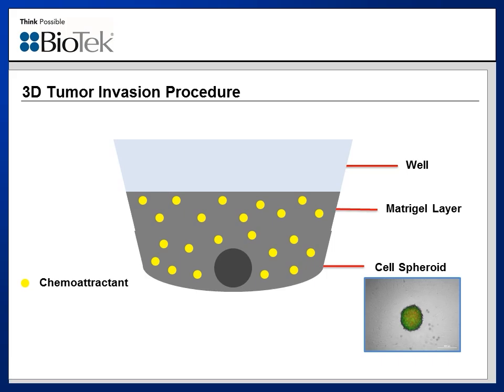And again, the same procedure is followed in the case of running an inhibitor experiment, with the difference being that an inhibitor is also added along with the chemoattractant to the aqueous and Matrigel matrix layers. Image-based tracking of tumor invasion is then performed for either type of experiment on a daily basis.